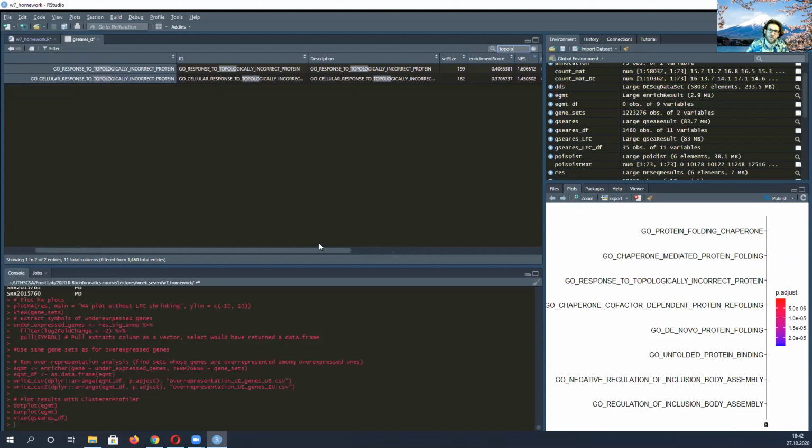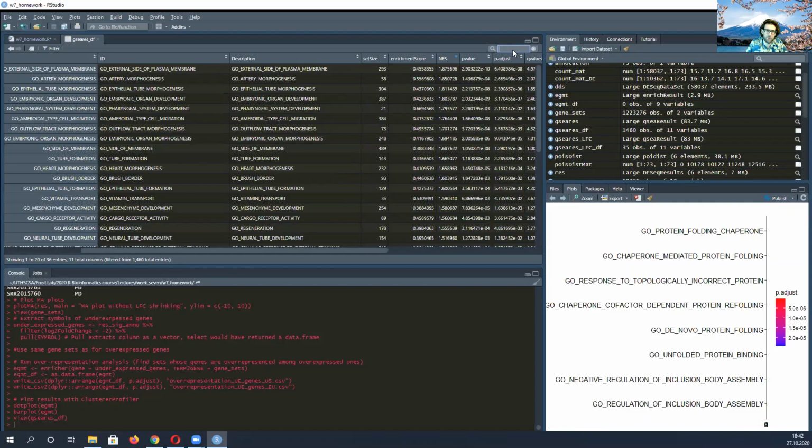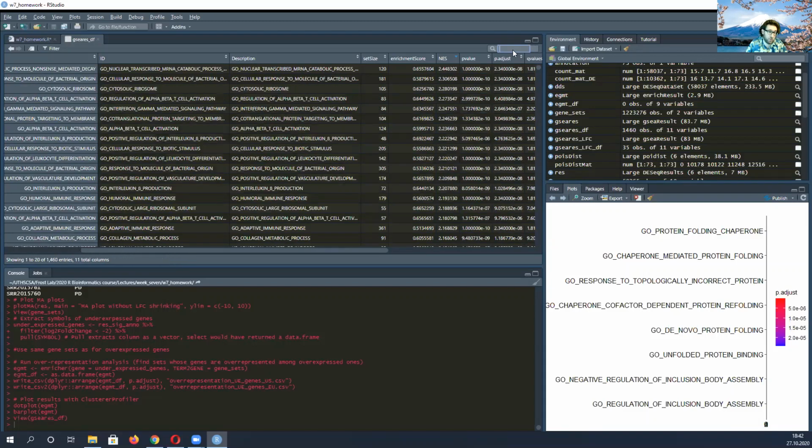So this is actually really interesting to me, Ben. Something to keep in mind here is that when you're interpreting this, you have to consider what the tissue source is. You mentioned that it's cortex. Is it sorted cells from the cortex, or just straight up cortex? I don't remember if it's sorted cells or not. Okay, I think it's probably just bulk cortex.